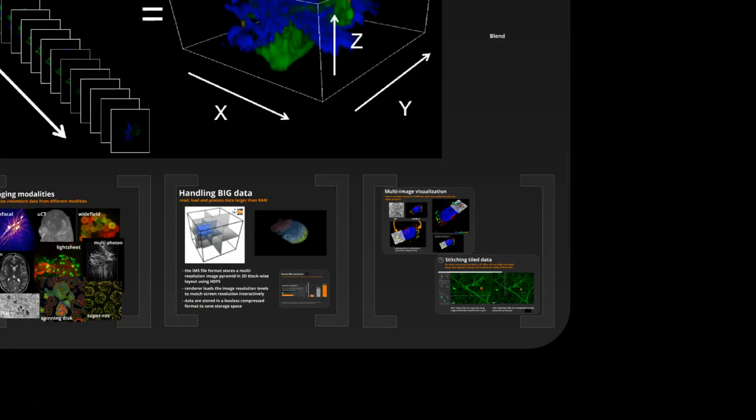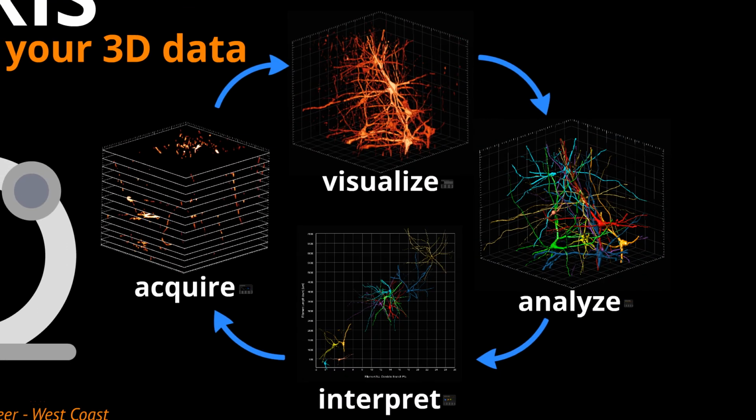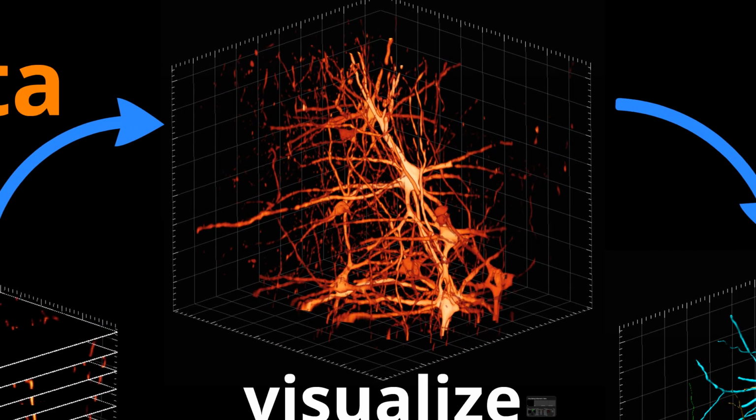Okay, so we're going to move on to visualization. Anyone feeling a little motion sickness yet? Okay, so we're going to zoom in now to visualization.